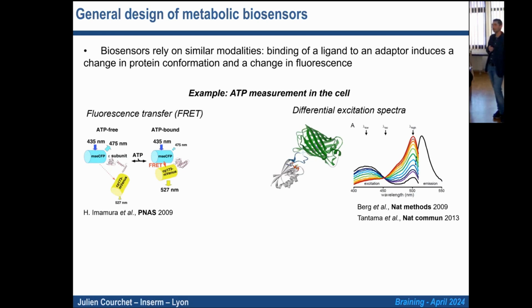So if your microscope can only excite with this wavelength, then you cannot use this type of ratiometric probe. But the advantage of this one is that it's very easy to detect the green. Whereas to detect cyan fluorescent protein and yellow fluorescent protein, you need specific lasers that not all confocals would have. So depending on what your microscope is, you would select one or the other.